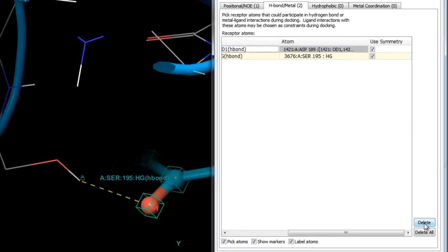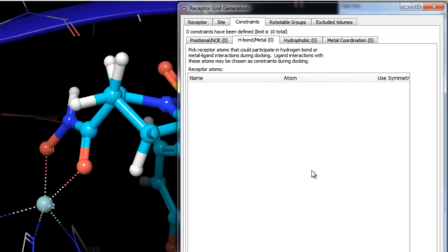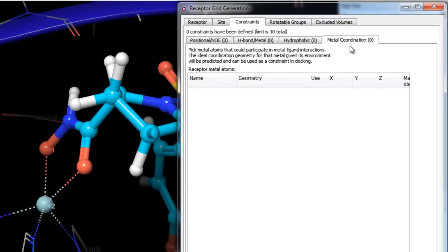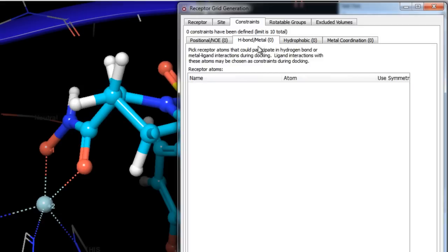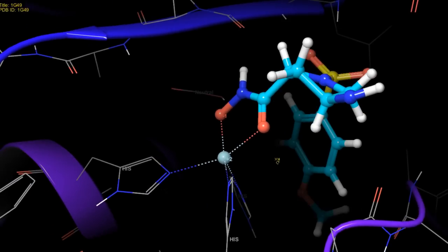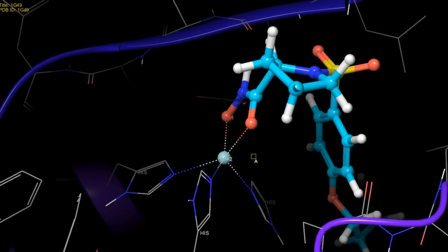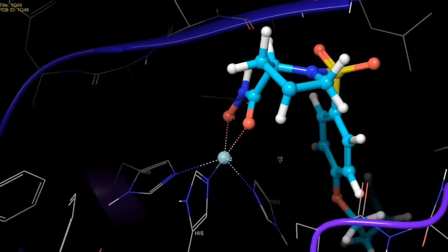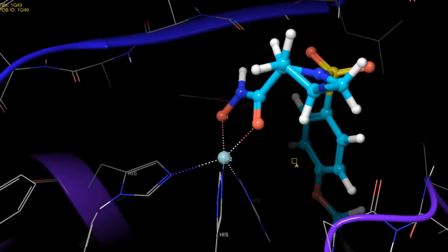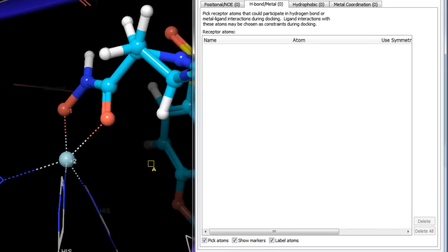In this example we'll keep only the H-bond constraint to the aspartate. There are two types of metal constraints: the metal-ligand interaction constraint and the metal coordination constraint. The metal-ligand interaction constraint is a requirement that a particular metal-ligand interaction is present when the ligand is docked — the ligand atom must lie in a sphere around a specified receptor metal atom with no directionality. Setting it up is similar to an H-bond constraint: ensure Pick is checked, then select the metal in the workspace.